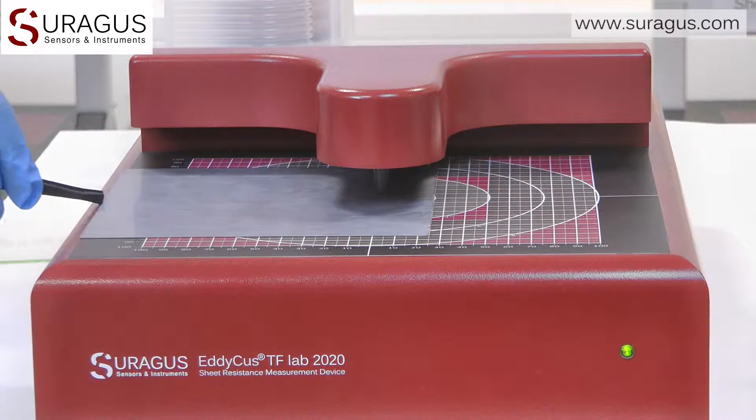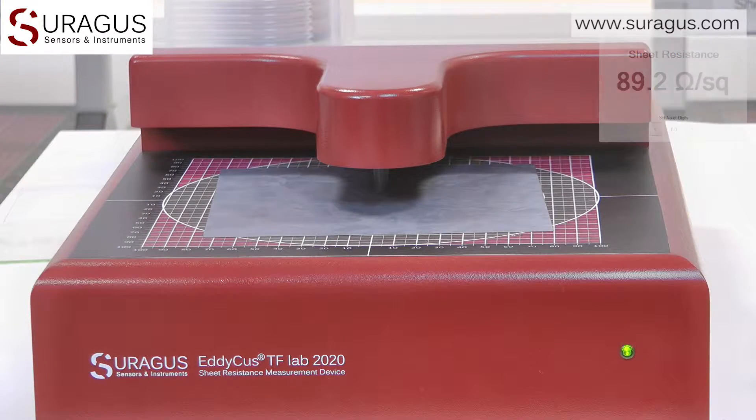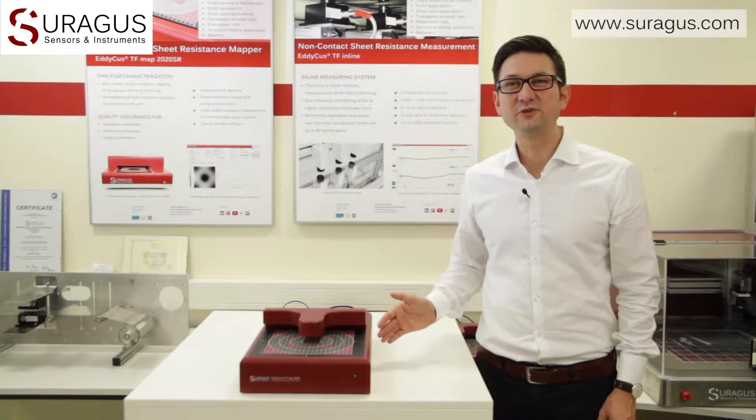The same is applicable to any layers of metal films, silver nanowires, metal grids, or even graphene. As you see, the TFLAB 2020 is a very useful measurement device for a huge set of applications.